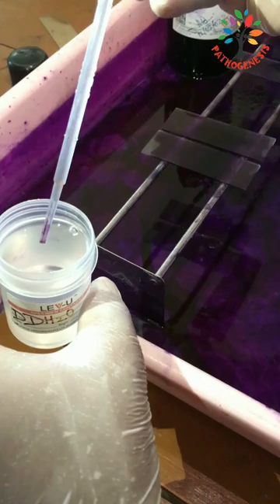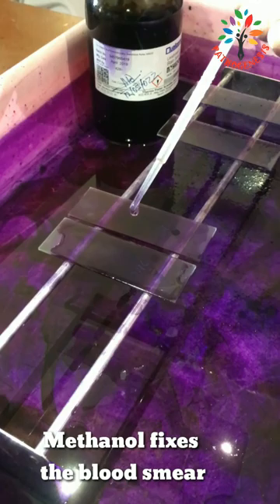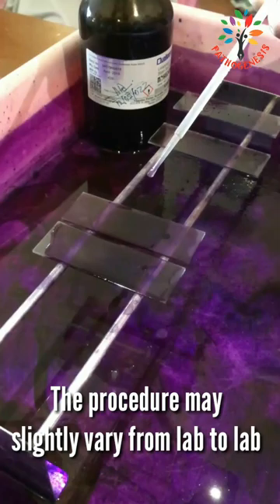The stain is usually diluted during the staining procedure. It stains the different components of blood in a range of shades between red and blue. The methanol used in the stain directly fixes the smear. Therefore, no extra fixation is required.